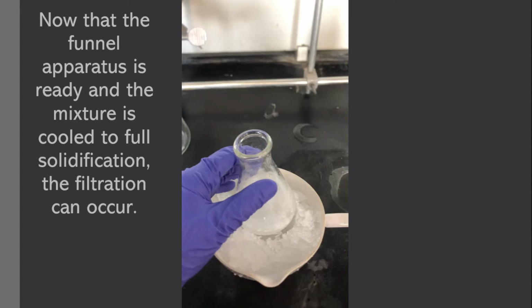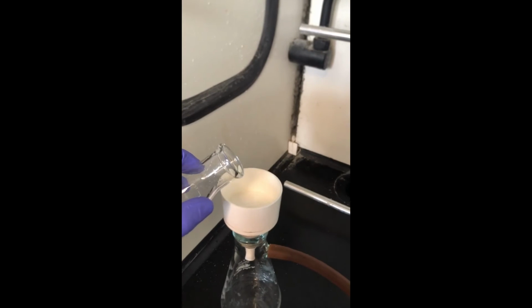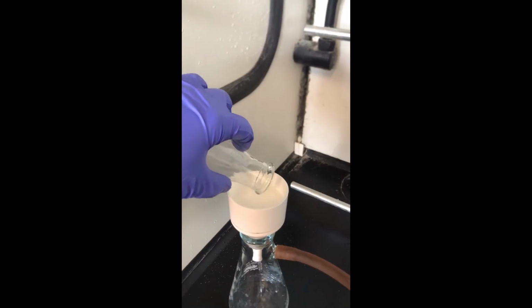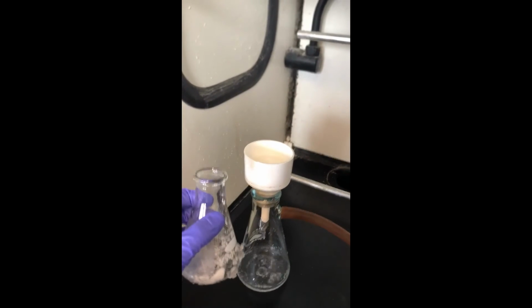Here you can see my precipitate cooling in ice to make sure that it is fully solid before I start the filtration process. Once you have that solidification, you can just pour it right on top of the filter paper, being gentle to make sure that you're not splashing over the edge so you don't lose any product. And you can already see it starting to pull the liquid through the bottom.